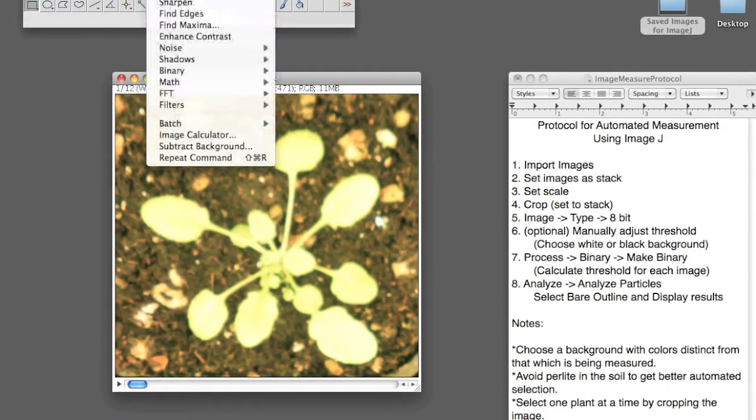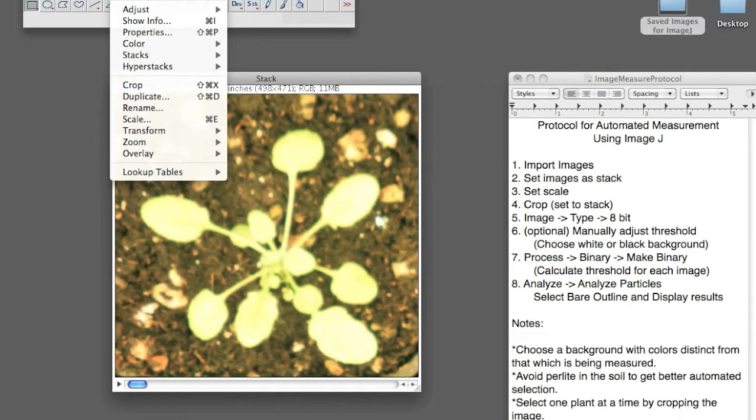And now you want to convert the image into an 8-bit type. So you go to Image, Type, 8-bit.